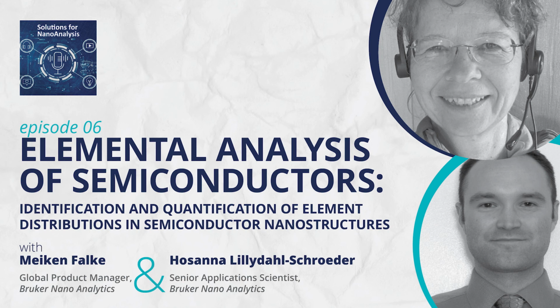One aspect is the collaboration. I would wish we would have more EDS suitable TEMs and SEMs. I already touched on that a little bit in EELS. Some acquisition or imaging conditions are good for one thing and others are good for EDS. And manufacturers are already starting to produce microscopes which can be easily tuned between different options and then also be optimized for the EDS option very quickly. We need to be optimized for EDS. We need high collection angles to be fast.